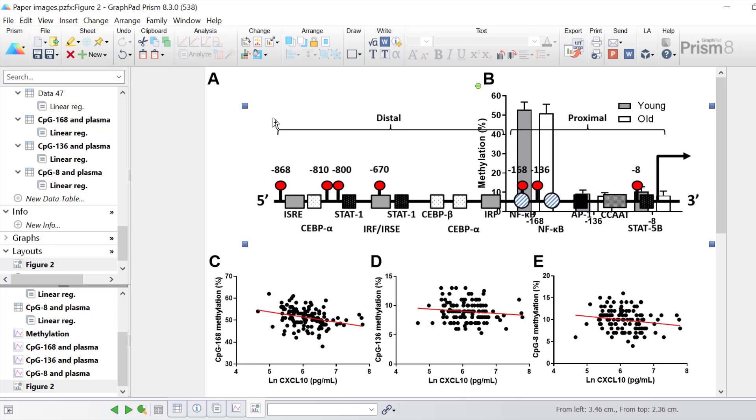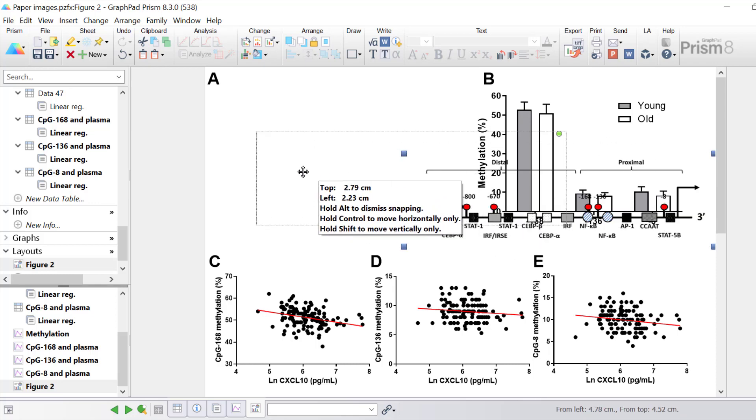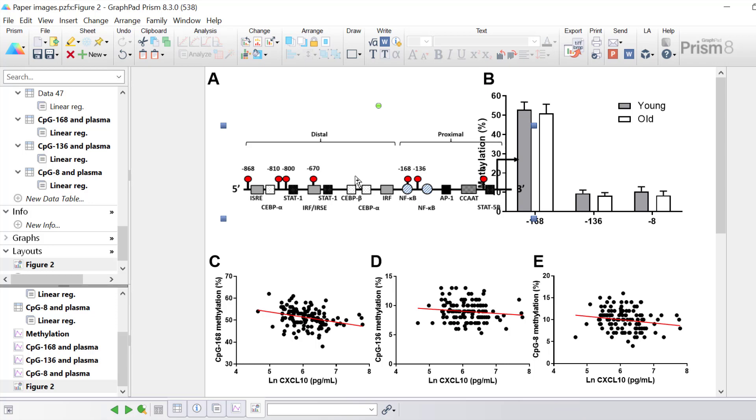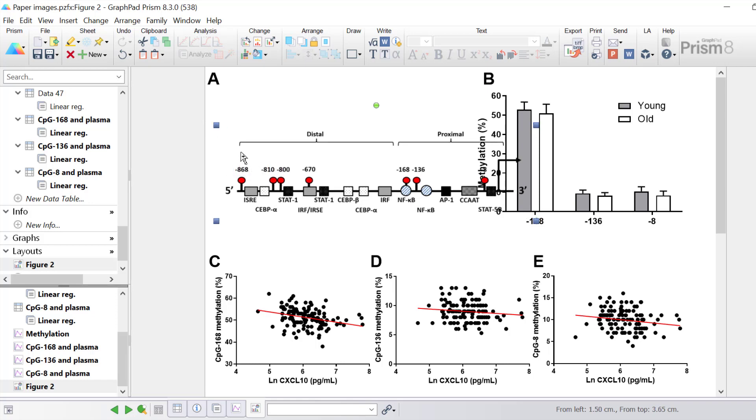You can click and drag on these squares to change the size of the image. For example I can make it smaller and I can click and drag to move the picture around on the layout page itself. Prism will keep the same image ratio on the picture therefore it won't distort the image.